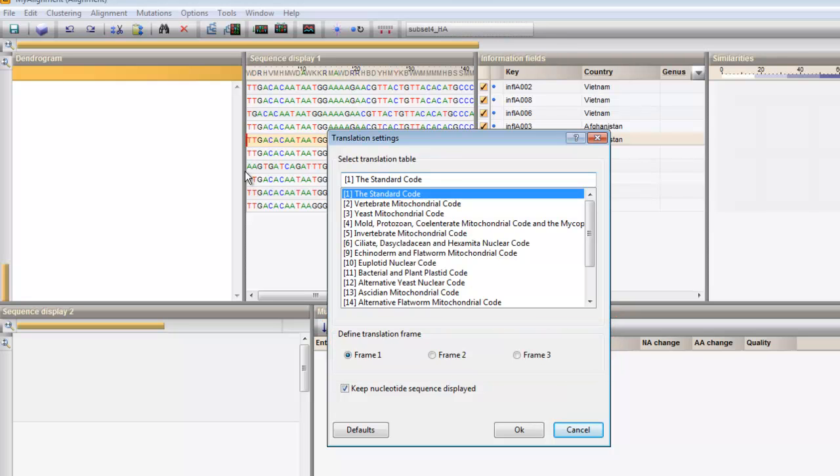If you wish to see both amino acids and nucleotides, keep this option checked.